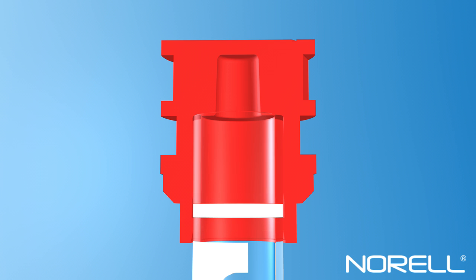Norlock 2 Security Caps are designed to work with the Norell Secure Series NMR tubes. The interlocking capability of the two components creates a positive physical restraint system to prevent tube and cap separation, especially when using troublesome NMR solvents such as chloroform.